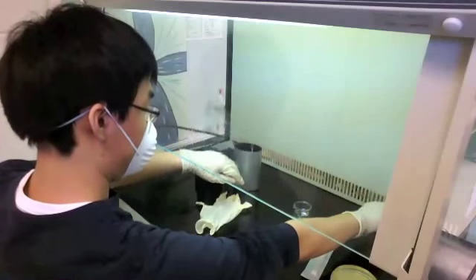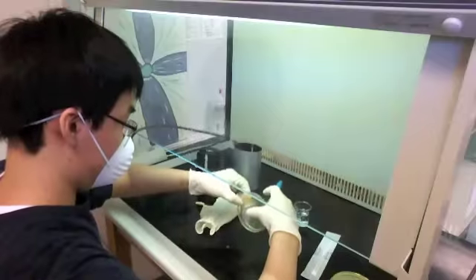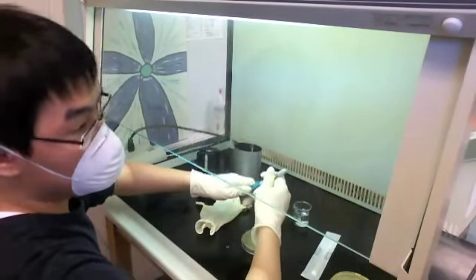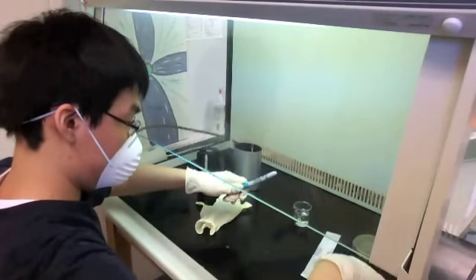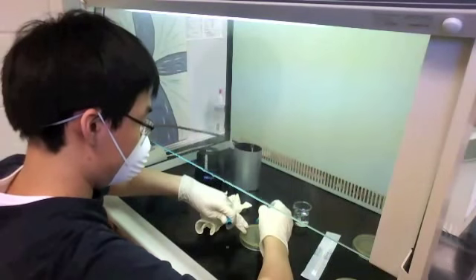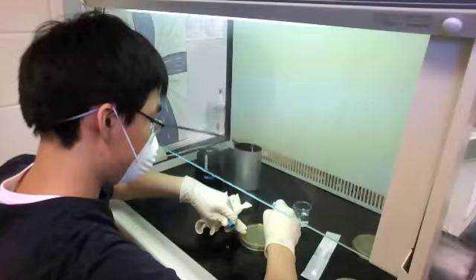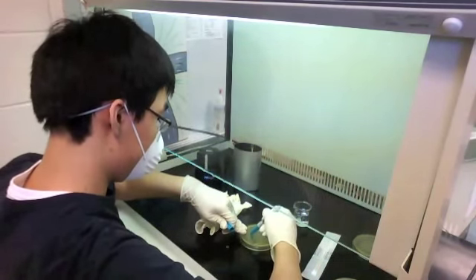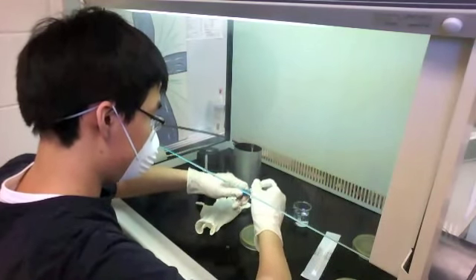Right now I'm moving things back a little bit to have more working space, and I'm labeling the petri dishes so I know which plate corresponds with what when I actually plate the bacteria or transfer it from whatever source that may be.